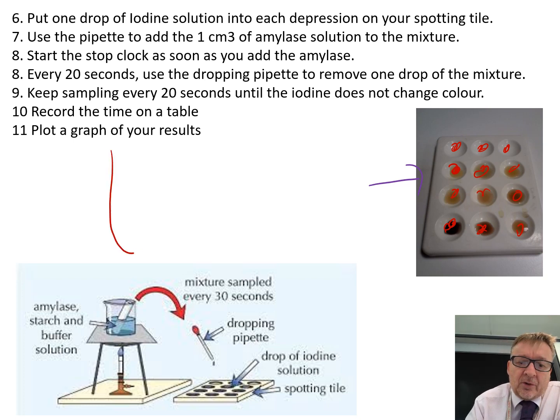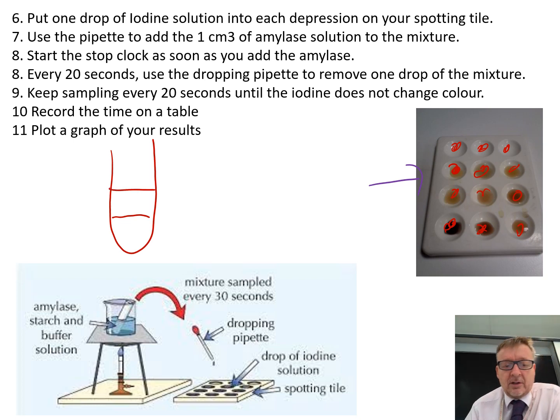Take your test tube that has the starch and buffer solution — 4 centimetre cubed. Add the amylase solution and pour it in. Give it a mix, and as soon as you pour it in, start the stop clock.